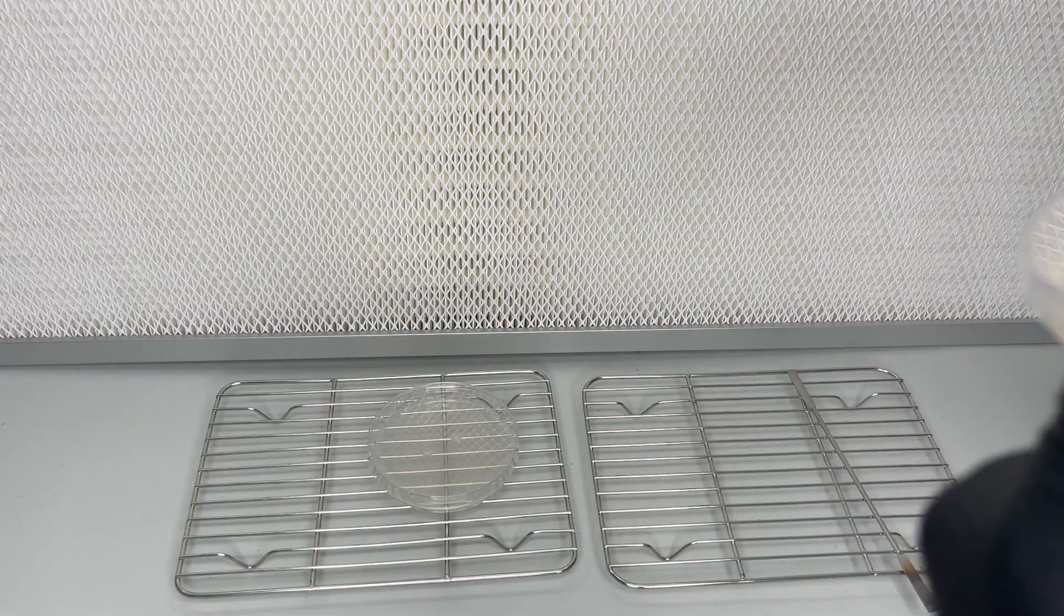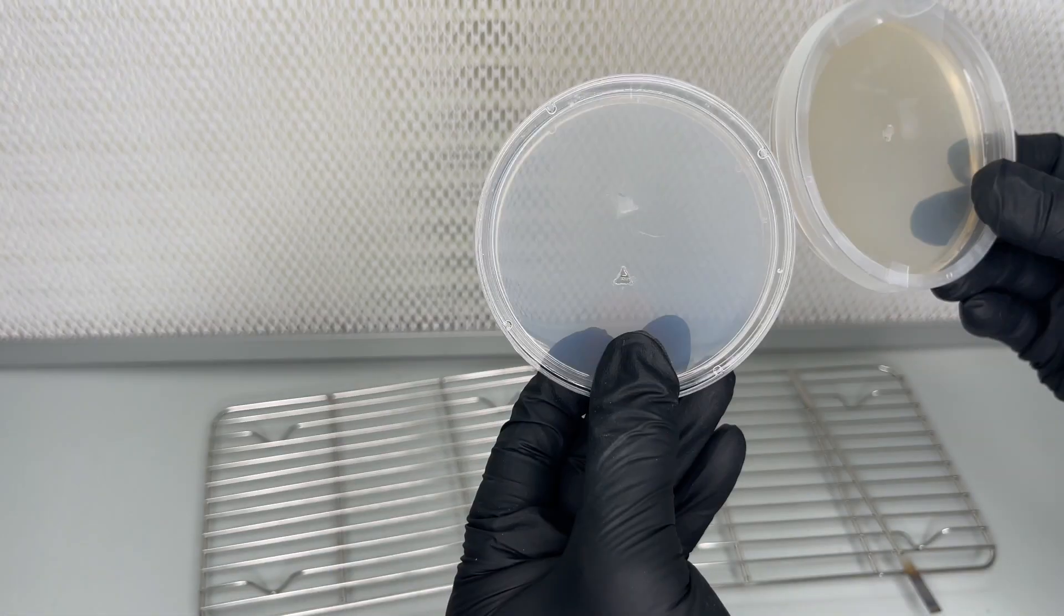The nutrient agar plate is wrapped in parafilm and allowed to grow at 75 to 78 degrees Fahrenheit for one to two weeks.